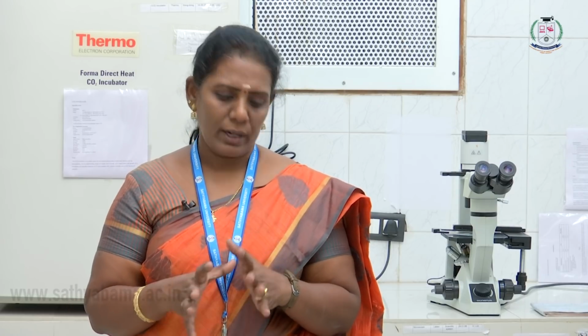So this is the regular methodology which has to be adapted for cell culturing and maintenance, and also preserving, and also we go for revival. Whenever we want, we have to go for a revival technique. So these are all the techniques adapted for culturing a particular cell line in one particular laboratory.